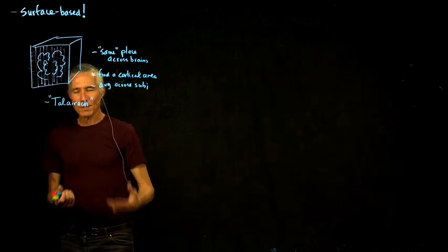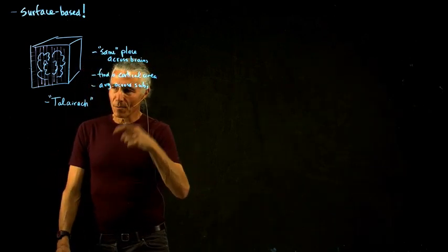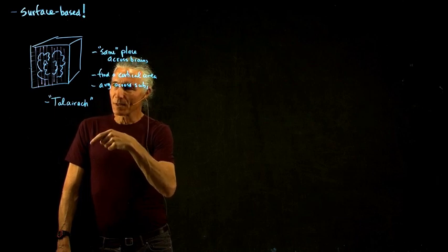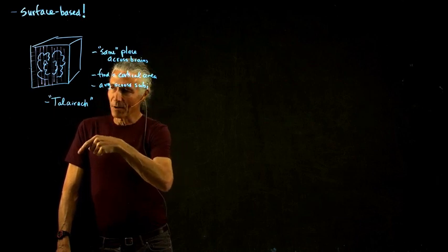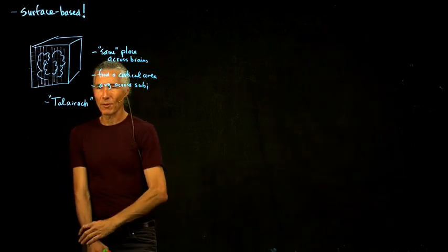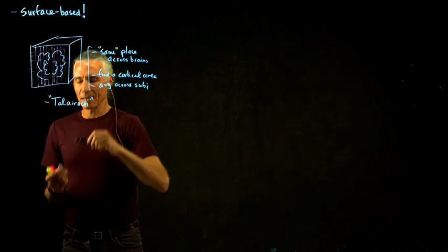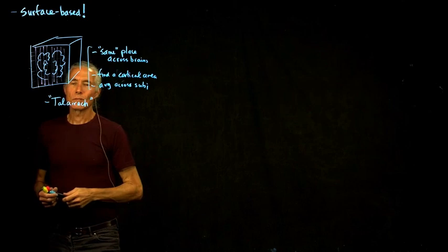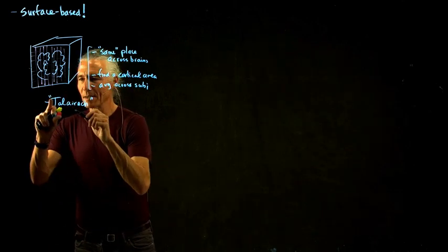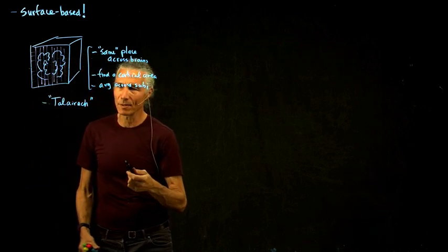The idea there was they were going to look for a tumor, or maybe try to remove a tumor, or put an electrode in and damage the place where the tumor is to try to get rid of it. And we want to go to the right place, go to the same place. So that was the origin of the method. There are all different kinds of versions of this. You could Talairach a brain or align a brain to an average brain.